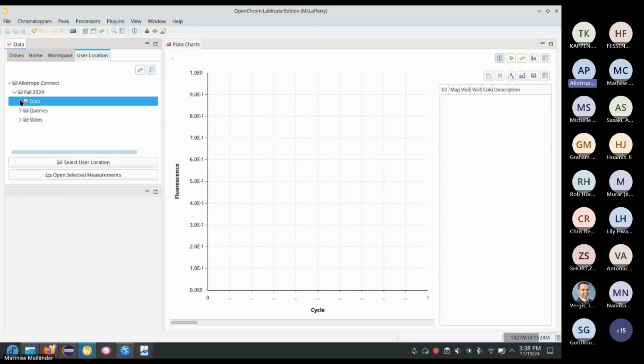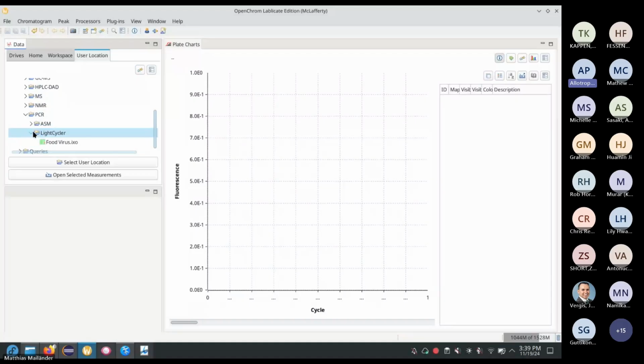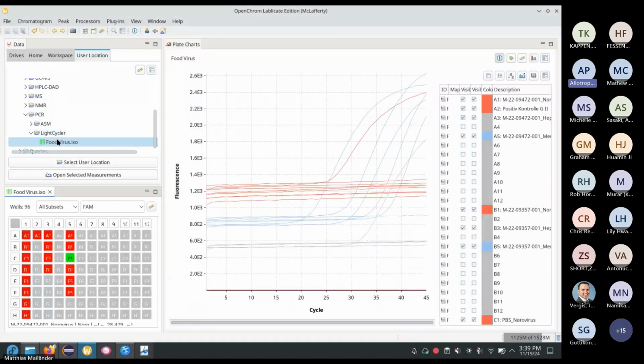This is maybe a bit strange. Why do we have PCR in the chromatography software? Well, before I joined Lablicate, I was a customer. And I basically told him, well, doesn't this look like curves, fluorescence data that you already have? And this is a file from Roche LightCycler, which is popular in the lab that I worked. They never break, really robust, super nice instruments.